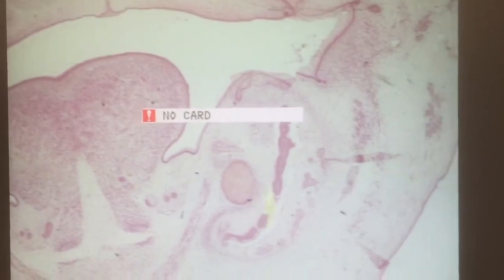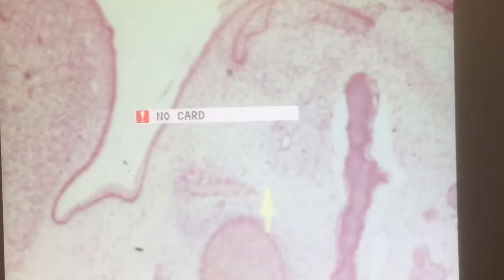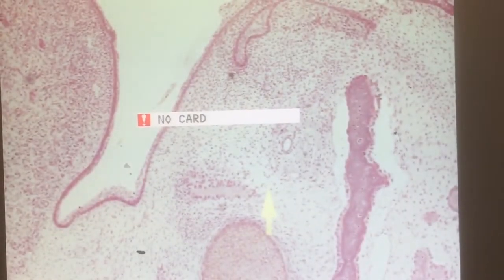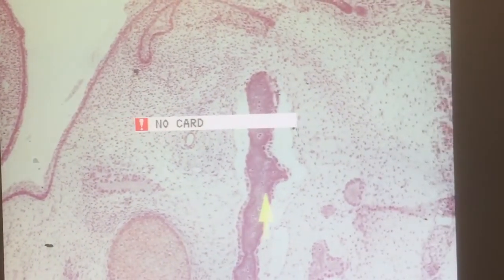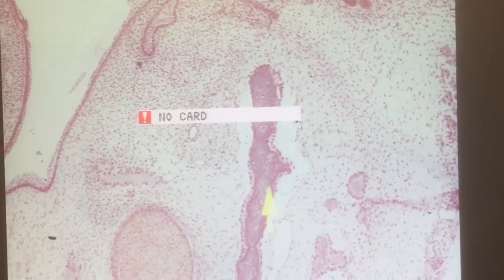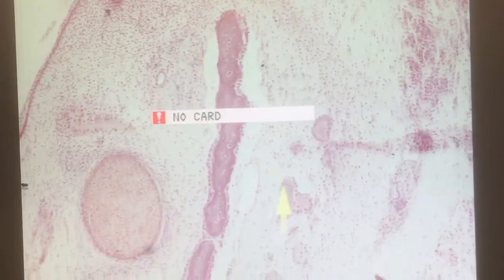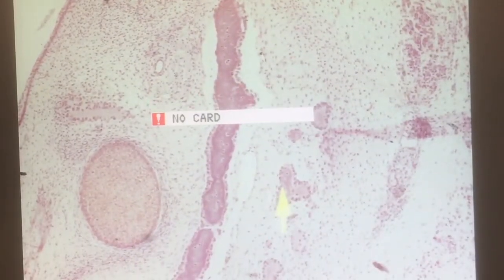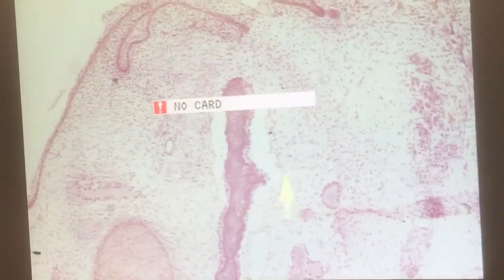Just lateral to that is a developing mandible. And as we increase the magnification, you can see a nice ring of osteoblasts all the way around that and some entrapped osteocytes. We see some other portions of the mandible forming alongside that. That's all mesenchymal bone formation.